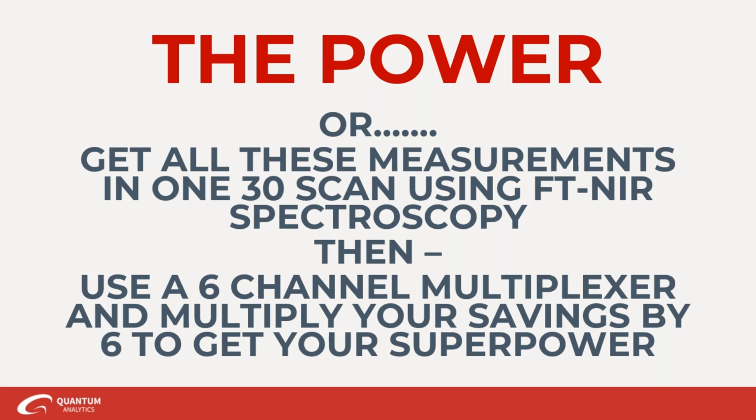So the first question is: is there a good way to know when you have enough samples for a good starter calibration? That's a very good question. So one big thing is what's called a design of experiment, where you sit down on paper and incorporate, as I mentioned, different variables from the natural products, for example. That's one thing you could do to take a look at how different variables could affect your final result.